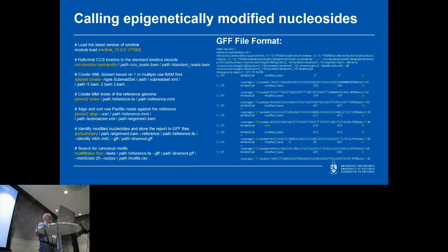This is a long process, and the problem is that with every new version of PacBio, they change the format of data storage a little bit. You always need to use the latest version. But the good news is that many sequence providers, like INCABA, for example, can do the job for you very nicely and provide you with a GenBank file and a GFF file.